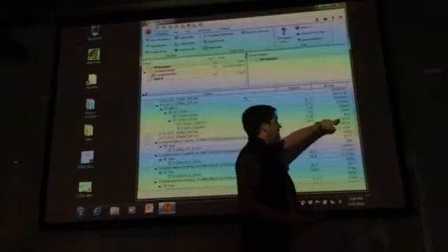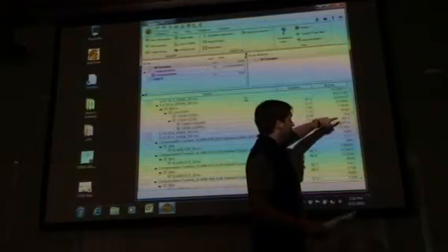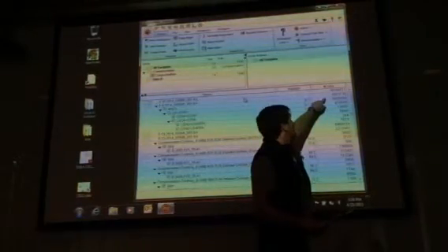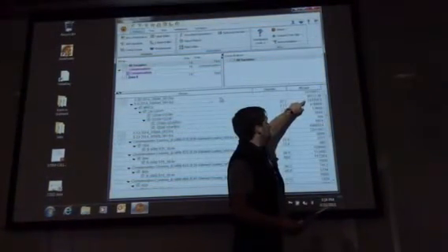What we want to see in the assignment is a gating strategy laid out something like this, and then we want you to calculate the frequency of these cell types in the cord blood mononuclear cells. So that what you're getting is this number here, or whatever it is, as a fraction of the mononuclear cell count, not of the total number of events, but off of this one.